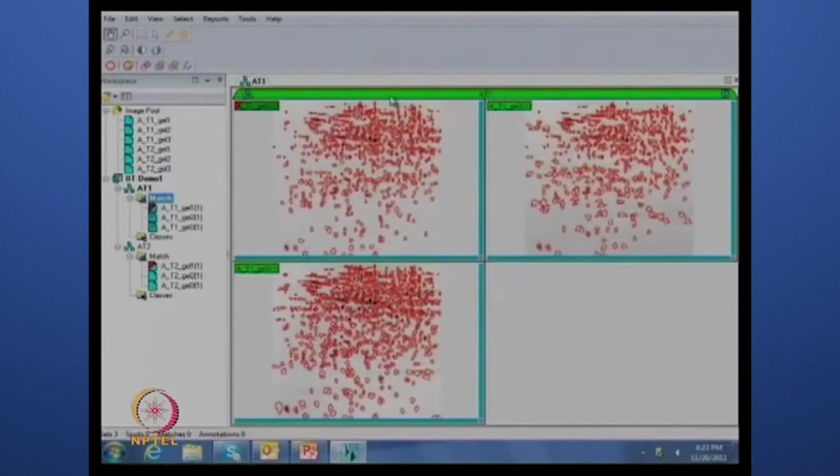So all the three parameters one can now accept. Exactly, and then detect the spots. That is what the software is doing, detecting the spots. Now it has detected all spots in this gel. If you are satisfied with this particular detection, then it's fine. Otherwise, we should zoom in on a region and see. Yes, exactly, I'm going to do the same.